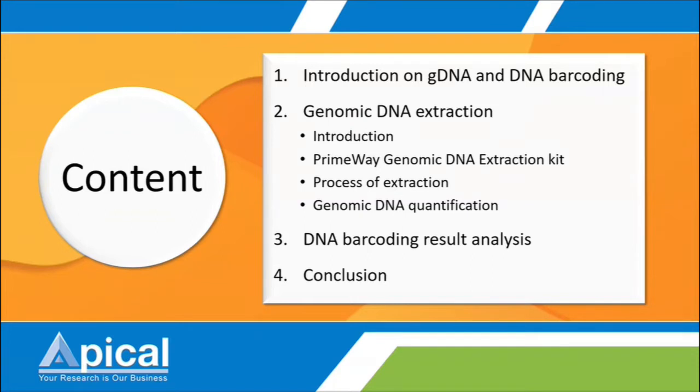study sample in DNA barcoding application. Within this section, I will share some general information, like why you need to use the chemicals in the DNA extraction, and some tips on handling.